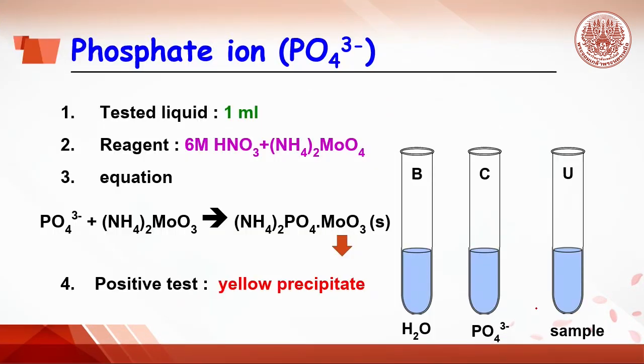In the case of phosphate ion testing, do the same by adding water, phosphate ion, and sample in the B tube, C tube, and U tube. Then, add the reagent by adding nitric acid, followed by ammonium molybdate.